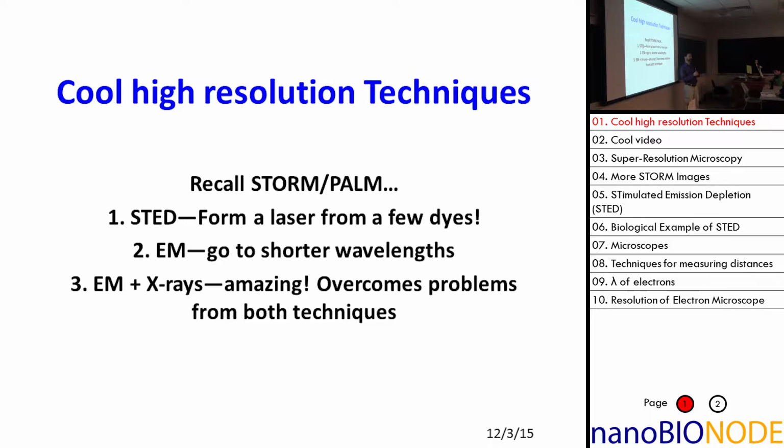You actually form a laser out of this individual or a couple of fluorophores, and we'll see how that gets you super resolution.